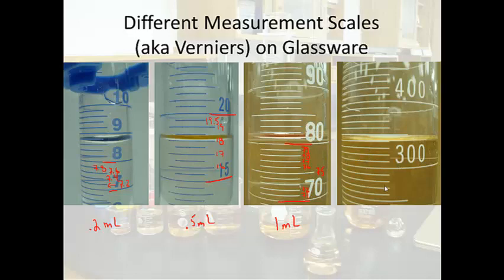This graduated cylinder is a little different. Here's the 300 mark, here's the 400 mark. I've got 1, 2, 3, 4, 5, 6, 7, 8, 9 lines in between. So that probably represents tens of milliliters. That's the graduation on this one. So this would be 310, 320, the big one here would be 350, 360, 370, 380, and 390.